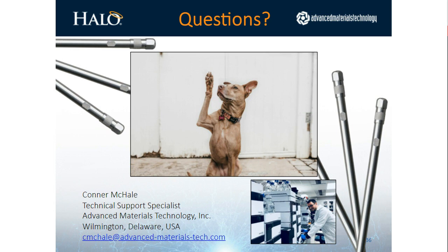Thanks, Connor. Someone else asks, does column void go away after a while? Say there's a pressure shock. Will the void go away after pumping solvent through for several minutes? No, once you have a void, you're in trouble. It's really important to kind of be careful with that.